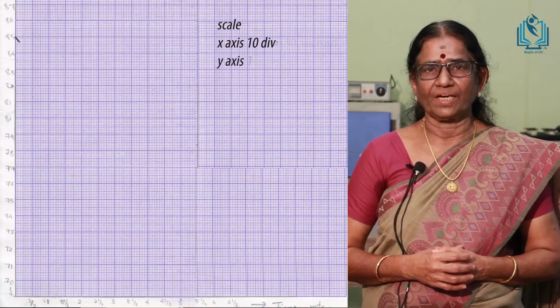So now we have completed the experiment successfully, and we have determined the delta TF values, that is the depression in freezing point. We have determined the freezing point of the solvent, then the solution 2 times we have determined. So we have got 2 delta TF values, and you have to get the delta TF values from the graph. Correctly you can get it from the graph.